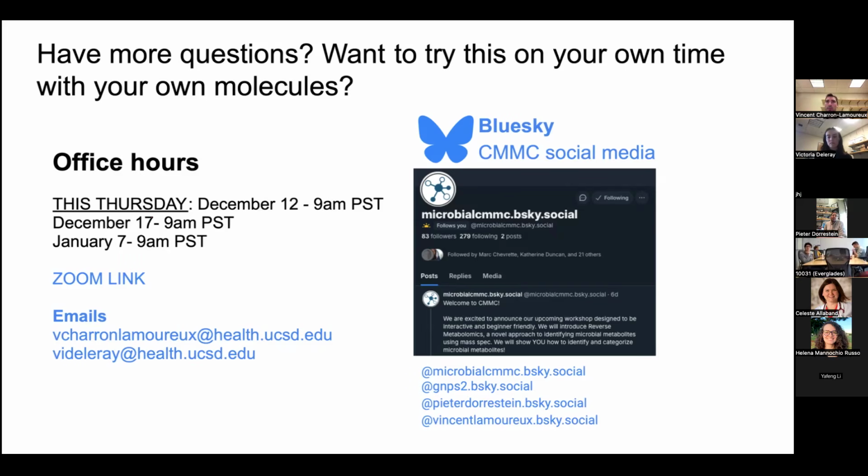There was a lot of data in the public domain of microbes grown in culture that didn't have any metadata. So we put a call out to the community: if you have data in any of these three repositories, let us know, and we would like you to curate each of the files with respect to taxonomy, that is NCBI taxonomy, so that when you then search with an MS/MS vector, you get taxonomic information.